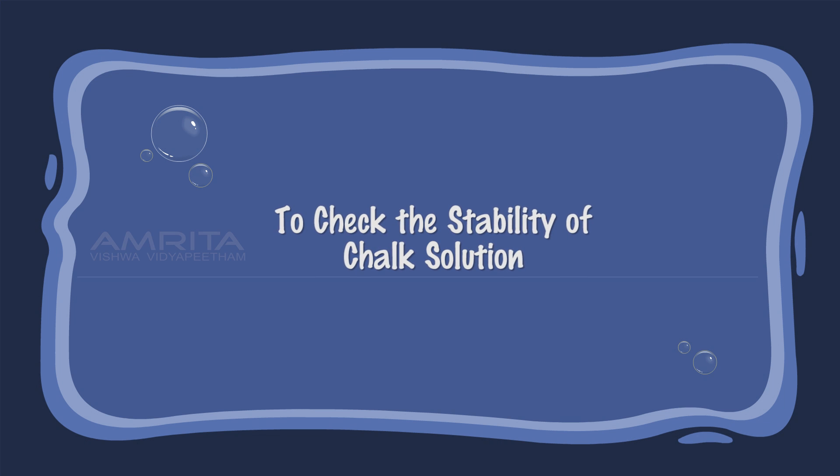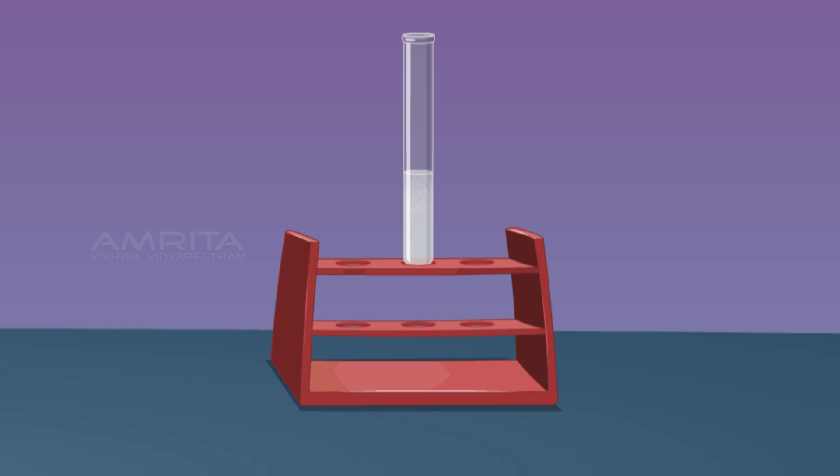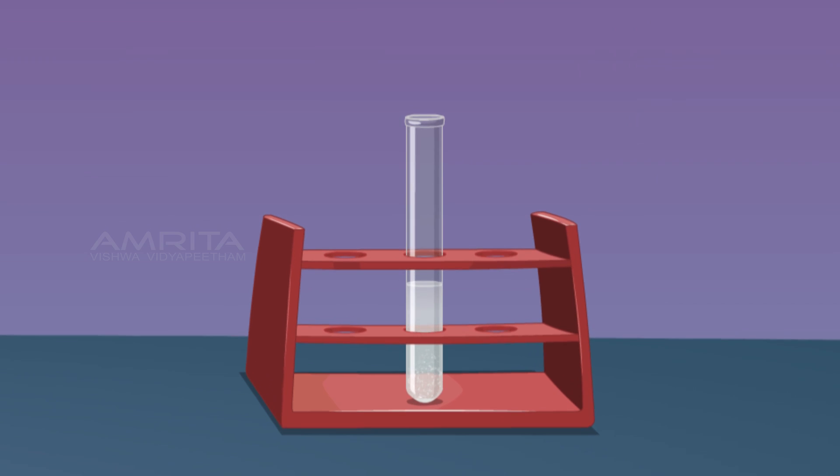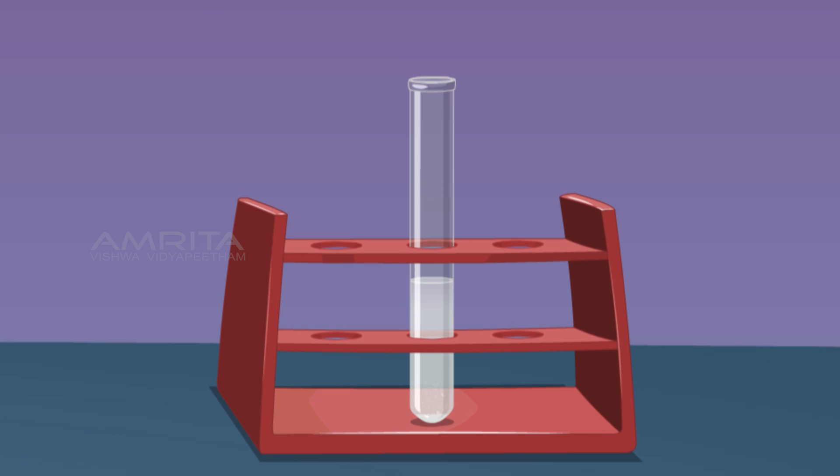To check the stability of the chalk suspension, take some chalk suspension in a test tube and leave it in the test tube rack for 20 minutes. You will note a gradual settlement of particles at the bottom of the test tube. This indicates that a suspension is unstable and shows settlement of heavier particles.